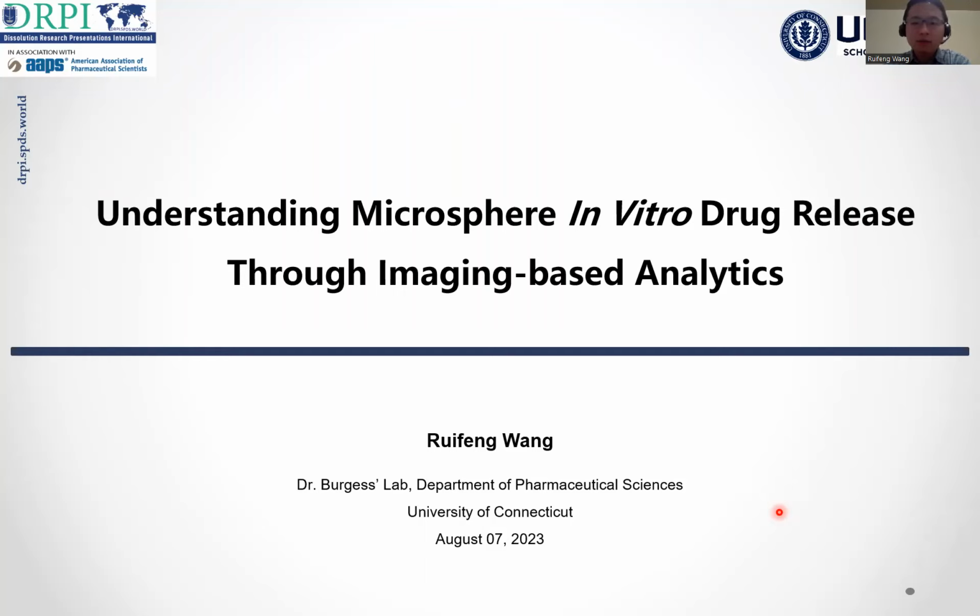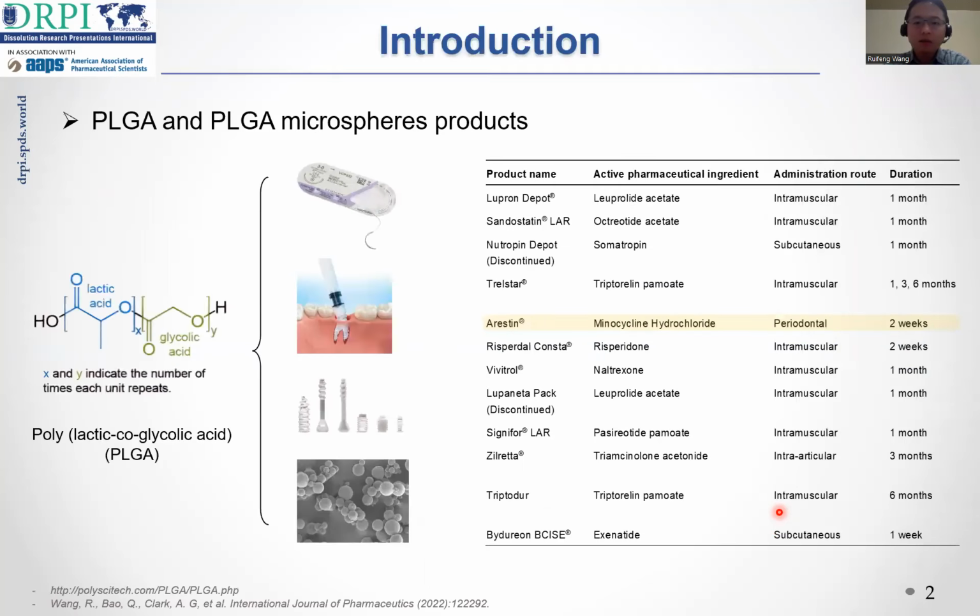The topic of my presentation is understanding microsphere in vitro drug release through imaging-based analytics. As known to us, PLGA is the most popular bioresorbable material and it became the reference material for many therapeutic products, such as sutures, grafts, implants, as well as parenteral injectable microspheres.